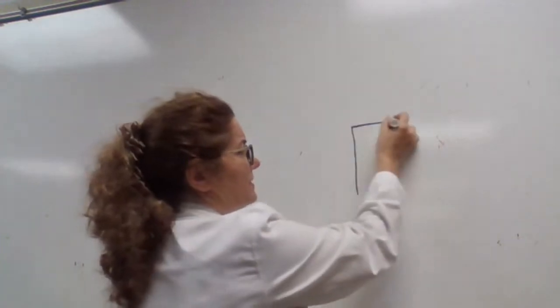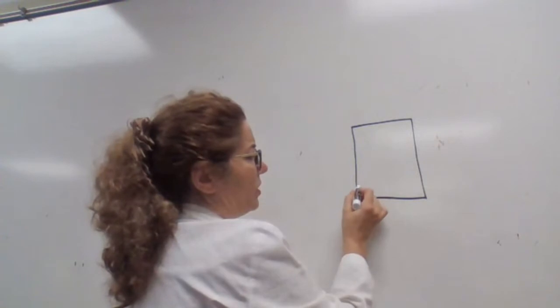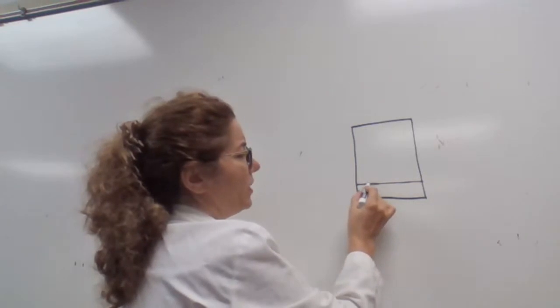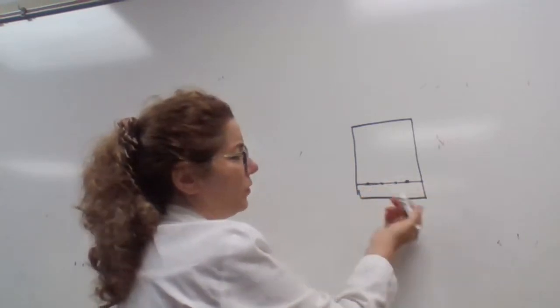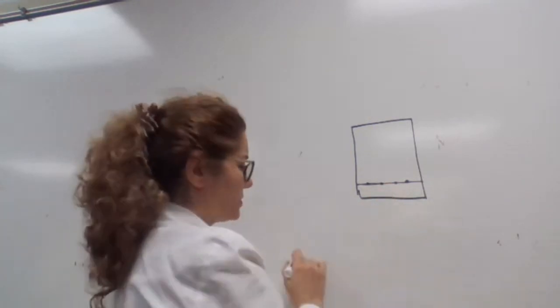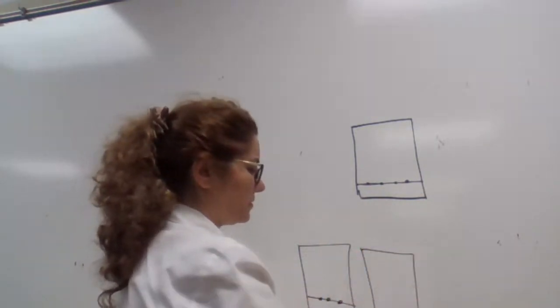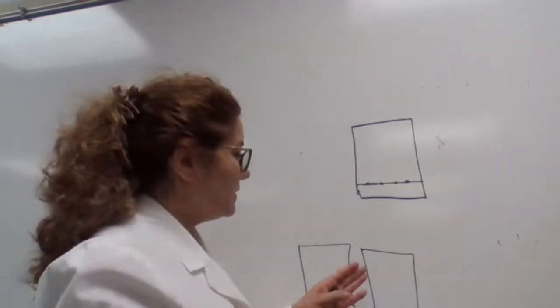So your TLC plate, you are going to design a TLC plate. You draw a line using a pencil. You should not use pen. You are going to mark your spots. You can do 4 in 1, and if you cannot fit 4 in 1, you can choose like 2 plates and do let's say 3 and then another 2. You can do that also.